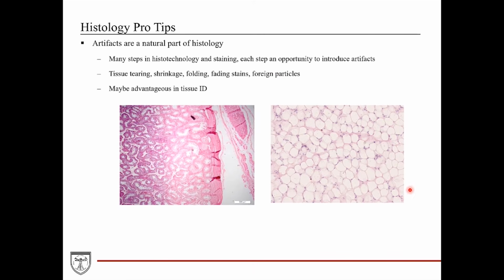Something like this is an adipose connective tissue, and where you see the pale staining area or non-staining area, these are all artifacts where the fat used to be that got dissolved away, and now we're able to recognize these really regular kind of circular structures as the adipocytes. So these are a critical component of adipose connective tissue identification. That's artifacts.